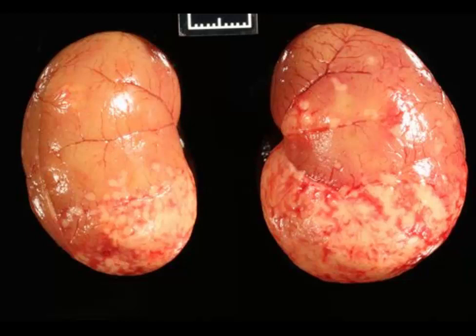All done? Okay. Well, these are kidneys from a cat. Cat kidneys tend to be golden in color because of the amount of fat that is present within the proximal convoluted tubules, which are higher than most other species, so it gives them a characteristic golden color. And then you have these subcapsular vessels, which divide them often into 4 equal quadrants. So pretty easy to identify that these are from a cat.